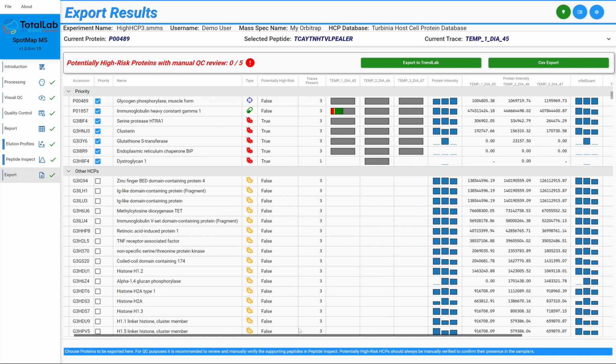And it also is a great way for you to go and look back at historic experiments, 5, 10 years in the future. You may not be able to remember, oh, what happened, what did we do, how did it go, was that run good or bad? If you just load up the report for that experiment, you'll get a very good visual indication.